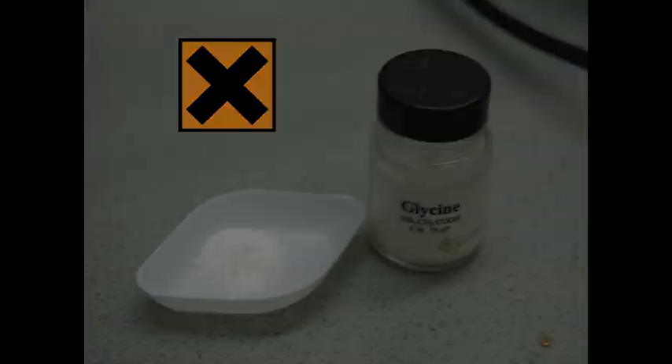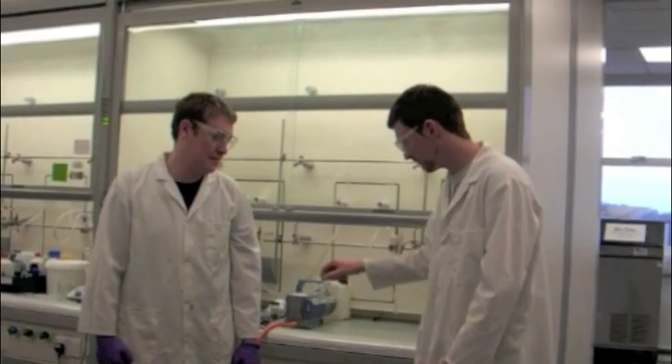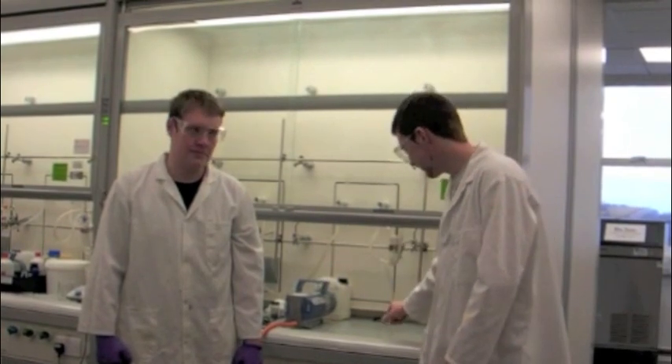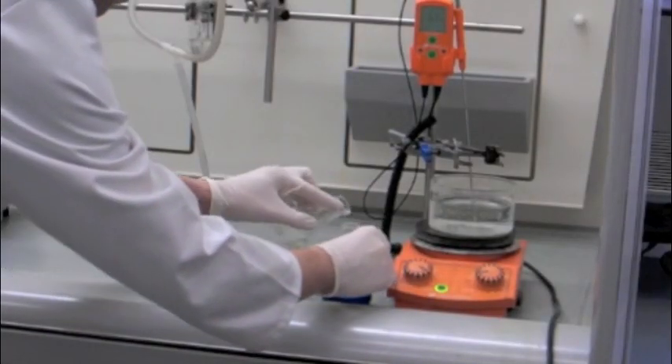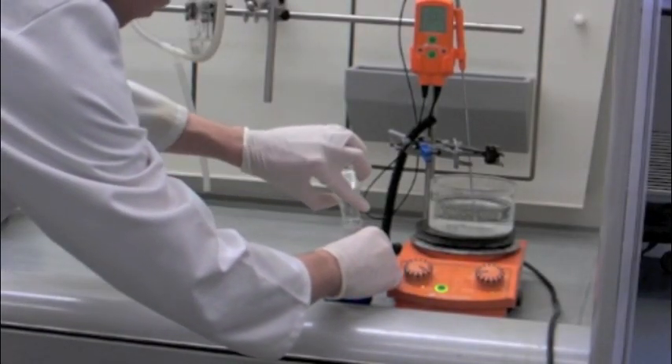Then, we weigh out 1.13 grams of glycine. This is also dissolved in hot distilled water with constant agitation. We then pour the glycine solution into the copper-acetate solution and swirl.